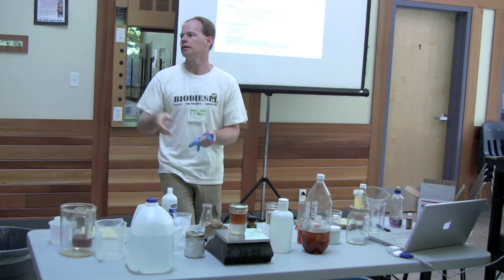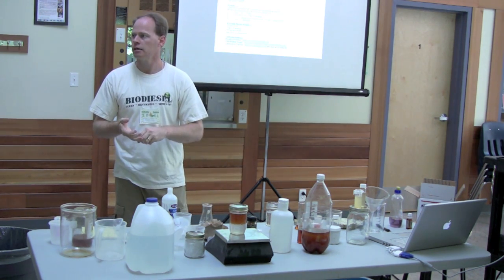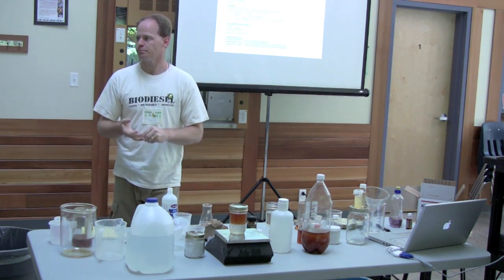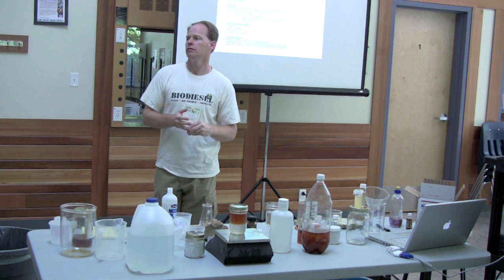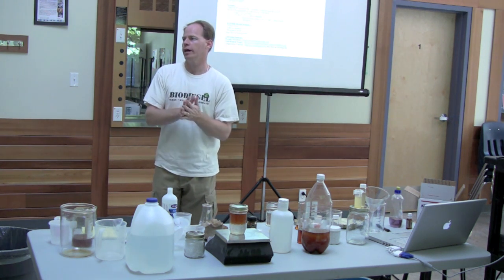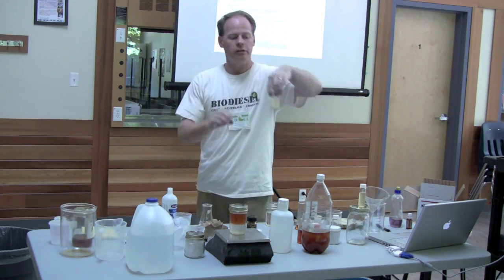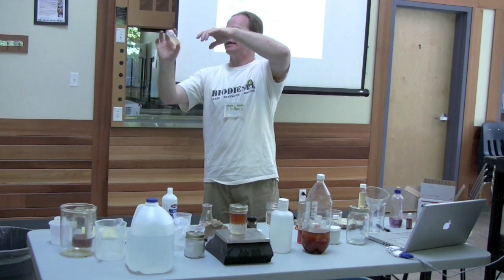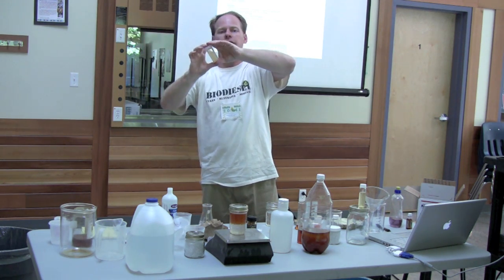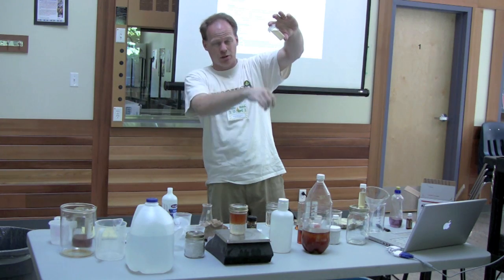Cool. Well, that's the one question I'll come back to. When you have a certain amount of unreacted oil and now you want to react the batch, do you just do another titration? I don't. I always do 30%. I take 30% of what I started with and hit it. Now, if it really failed, like all 3 milliliters came out, I'll retitrate and redo it. But if it's just like this, I don't know if you can even see this much, I'll pass it around, but this is almost a quarter of an inch.